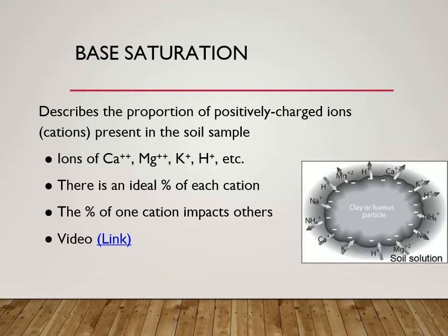So things like calcium, potassium, and they're all going to end up in a beaker, right? All of them floating around in there, and then they're going to use probes and tests to measure each individual element, and they'll find out how much magnesium is in there, how much calcium, how much potassium, etc. And that gives them a snapshot of what is actually on your soil, not in it in terms of the water solution that's around it, but what is on your soil.